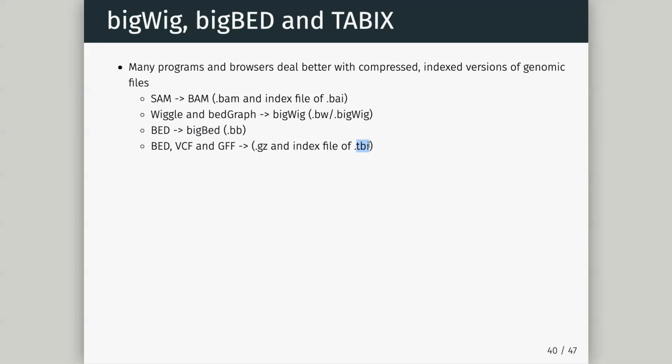These are also not just useful for our programming. When we want to use IGV, IGV doesn't want to load the whole file in memory. It just wants to load the window we're looking at. So we'll see that very soon.